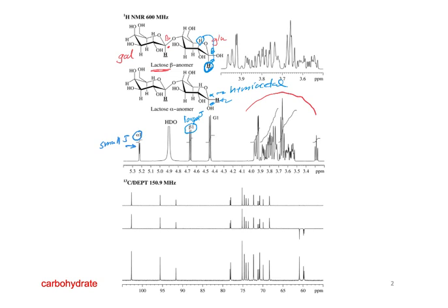At the galactose position here, both of these, because they have the same stereochemistry, it just gives one signal. Even though there is this difference, it's far enough away that this difference in stereochemistry at these anomeric positions doesn't affect the chemical shifts clear over here. So we essentially have 3 signals here in the anomeric positions from these 2 compounds.